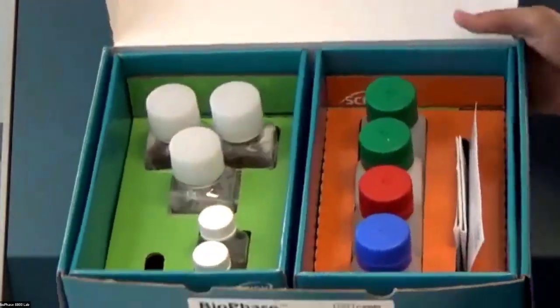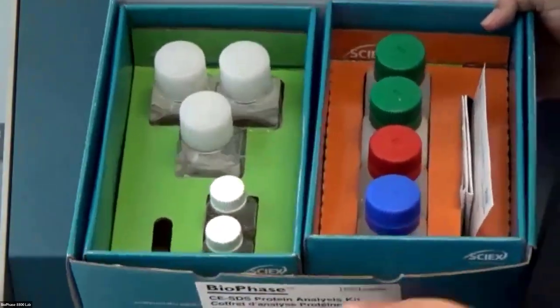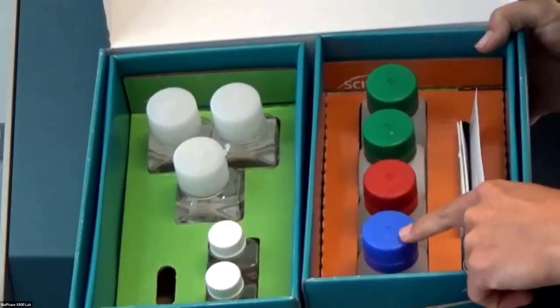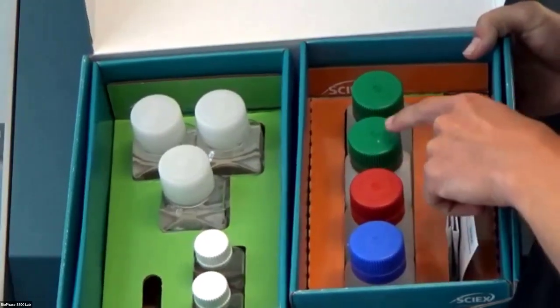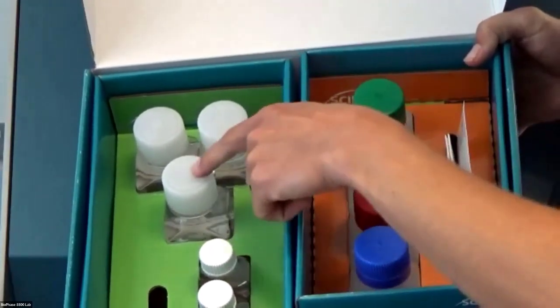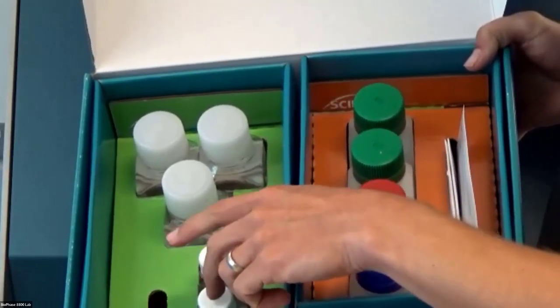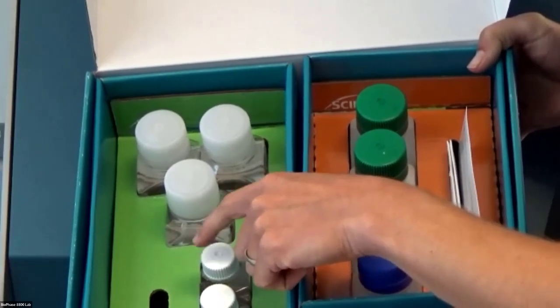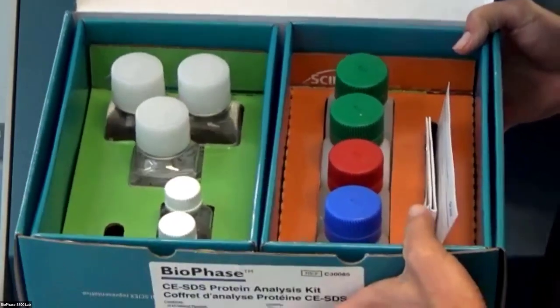So here is a look at our CE-SDS kit. You'll notice that we have a lot of different colors going on. Here we have our basic wash with a blue cap, our acid wash with a red cap, our gel buffers with green caps, waters with this opaque cap, and then our sample buffers down here, both are low pH that we can use for our non-reduced analysis, or our standard pH 9 buffer we can use for either one, our reduced or non-reduced.